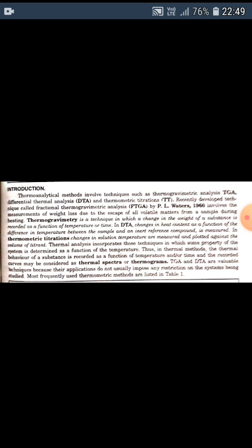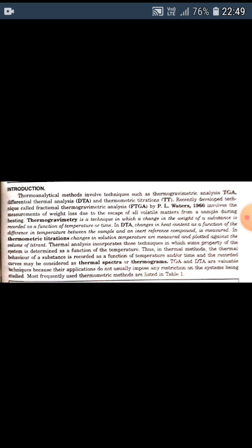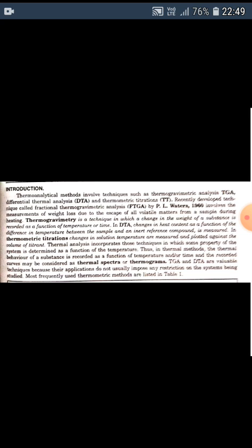Thermal analysis incorporates all those techniques in which some property of the system is determined as a function of the temperature. In thermal methods, the thermal behavior of a substance is recorded as a function of temperature and or time, and the recorded curves are considered as thermal spectra or thermograms.